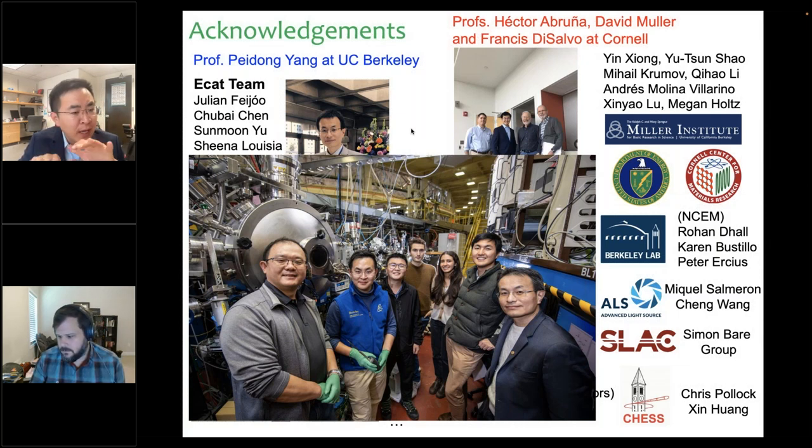In the long term, if one has a universal liquid cell holder without the formation of hydrogen bubbles, the technical requirement is that we form a pristine liquid with a thickness on the order of 100 nanometers. That is basically what we need. We don't need the infinitely thin liquid. Of course, with thinner liquid we also have higher resolution, but below 100 nanometers we have increasing challenges of mass transport. So if we are shooting for about 100 nanometer liquid thickness, it's fair to say that in the next few years we would see the development of microchips that can enable a pristine 100 nanometer liquid, and that would be very helpful for the community. They can pursue that electrochemical reaction without the worry of having to accommodate the formation of gas bubbles.